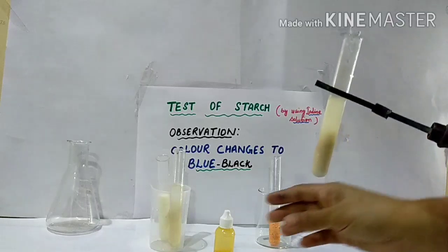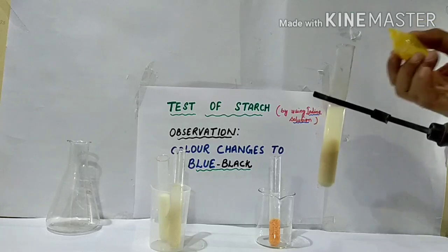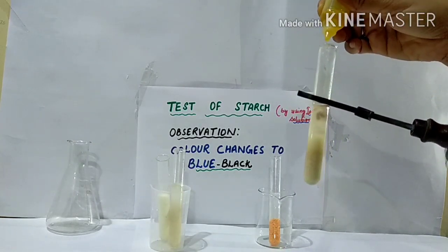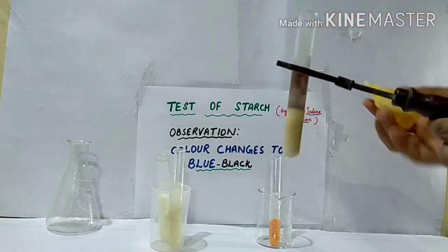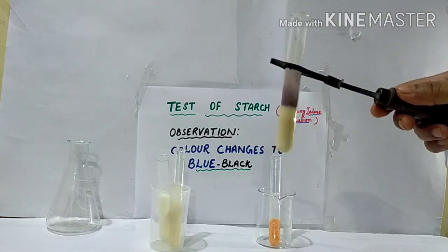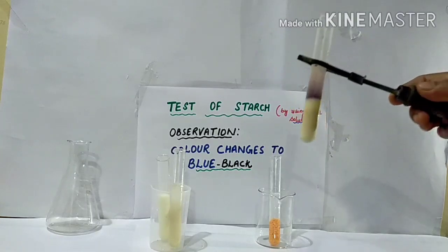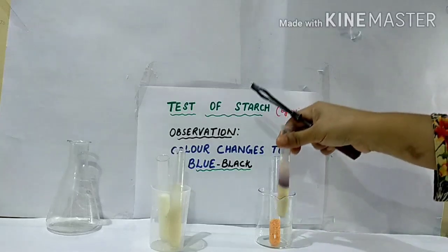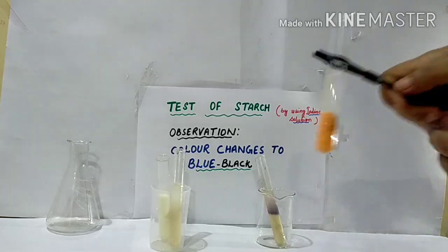I will put a few drops of iodine solution into the wheat flour and we'll see whether the color changes or not. You can see the color has changed to blue-black. This means that wheat flour contains starch.